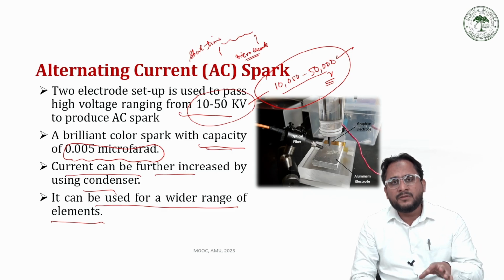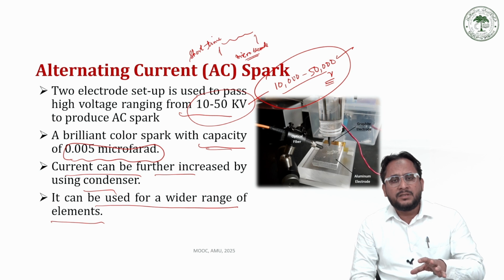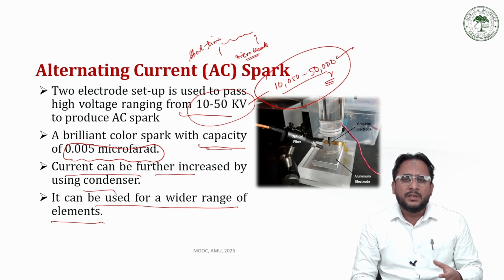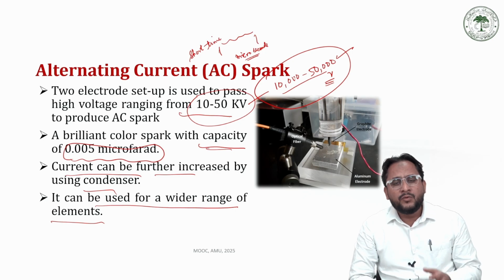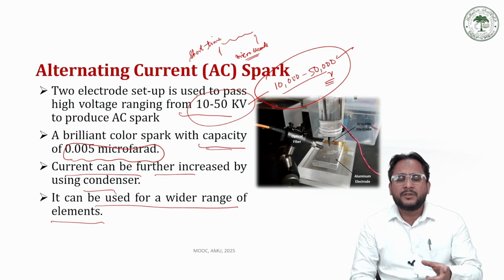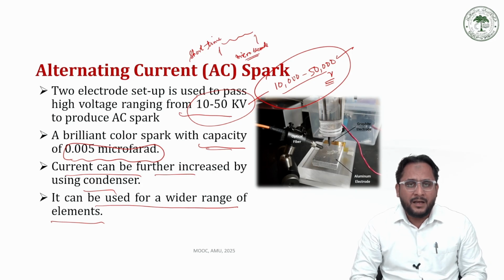Therefore, most of the time we require a dilute sample. But if we have a concentrated sample and it is not possible to further dilute it, then we may go for using an AC spark, because it exists for a very short period of time, so even higher concentrations do not affect this particular analysis.